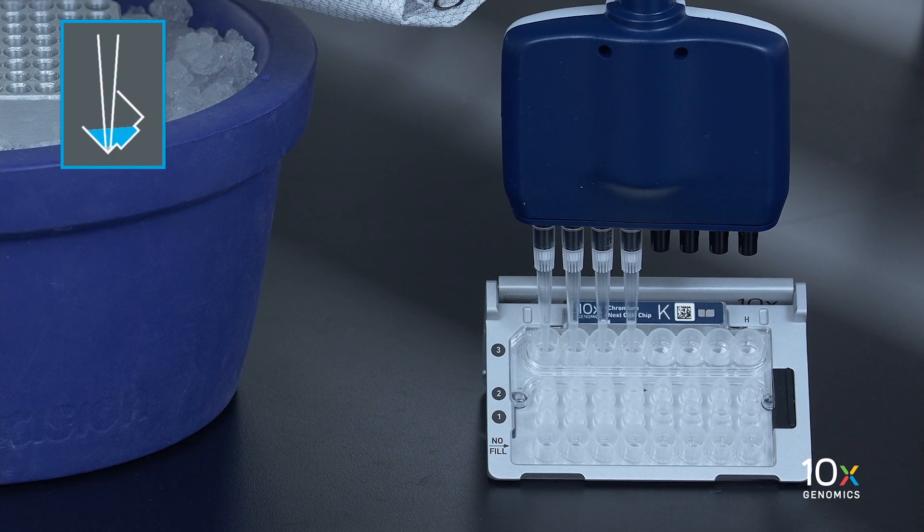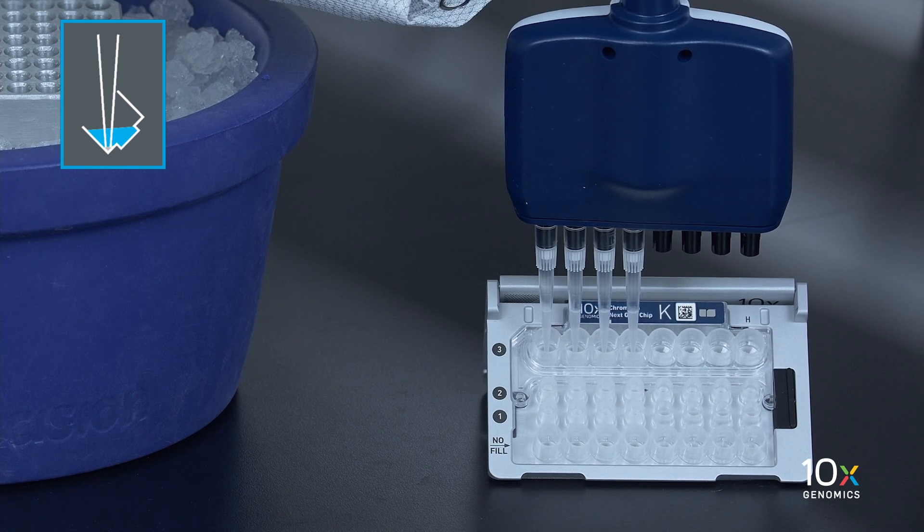Slowly aspirate 100 microliters of gems from the lowest points of the recovery wells in the top row labeled 3, without creating a seal between the pipette tips and the bottom of the wells.